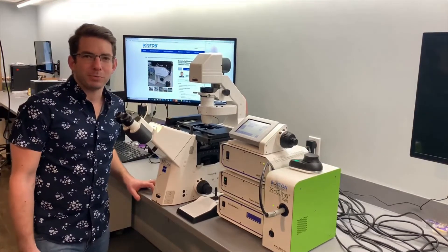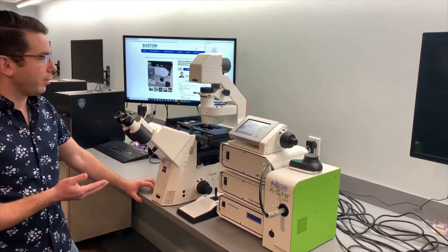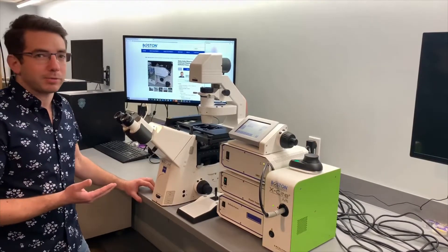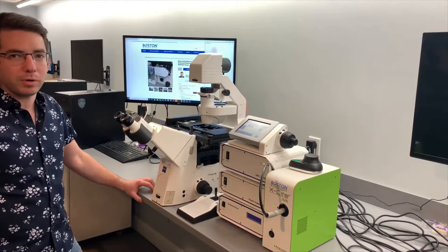Hi, this is Brian with Boston Microscopes. Today we're featuring the Zeiss Observer Z1 Inverted Fluorescent Motorized Phase Contrast Microscope. It's fully motorized and one of the newer microscopes that we have. It's also one of my favorites.